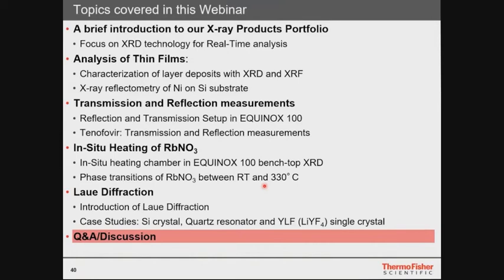Thank you, Simon. Next question is related to sampling methodology. The question is, by crushing the sample, is there any change in measurement? It depends on the sample and on how you crush it. For example, if you use an agate mortar, and if you are very careful, you can usually crush any sample.